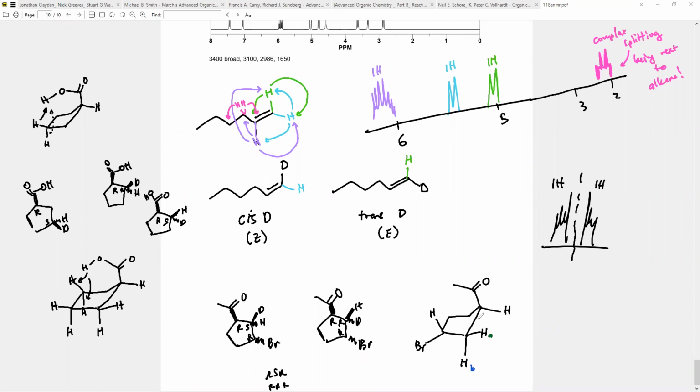So in this case, for this carbon, this is bound to carbon and carbon. I mean, maybe around 2 because it's kind of close to bromine, whatever, it's around 2, somewhere like 1 to 2. So I'll put like 2 here, or 1 is over here, 2 is here, something like that, right? It's relatively boring, these hydrogens.